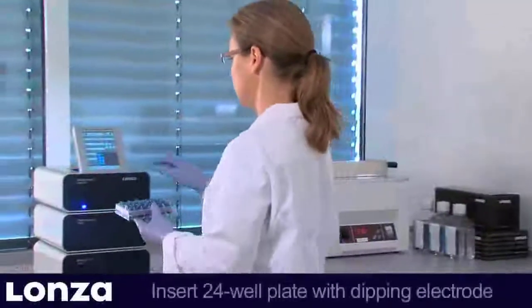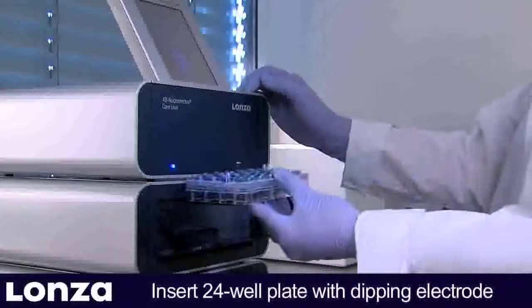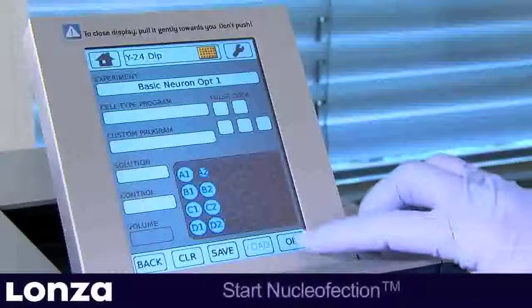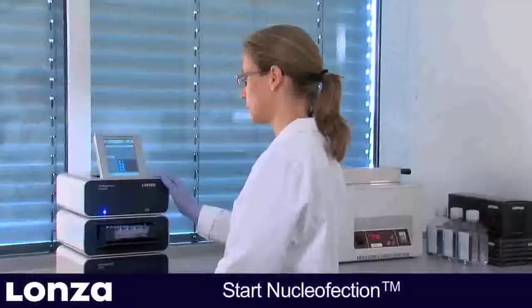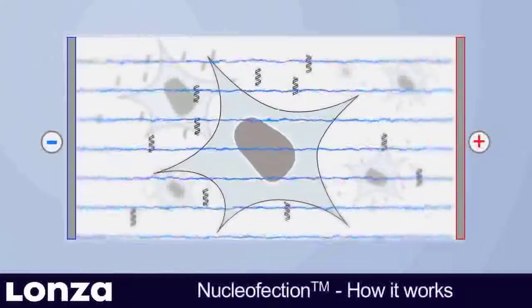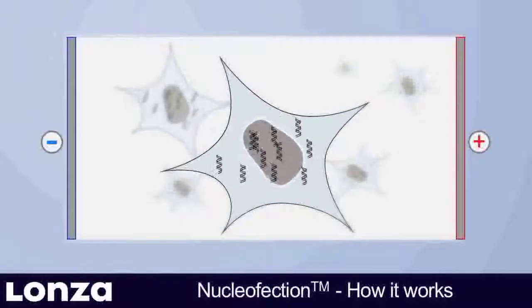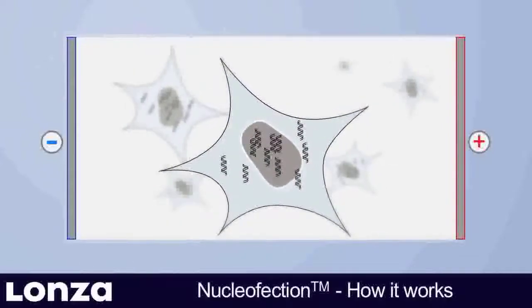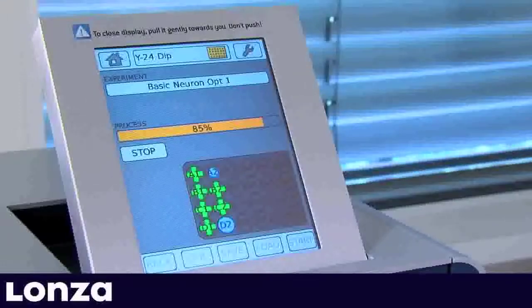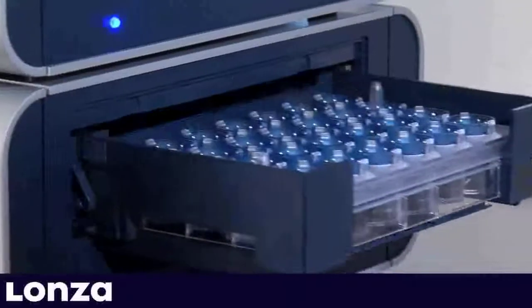Place the 24-well plate with the dipping electrode into the 4D Nucleaffector Y-Unit. The predefined experiment is started by pressing OK on the touch screen. Each well is now processed individually. Nucleaffection transfers the substrate into the cytosol and the nucleus of the cells, thus enabling transfection of resting and non-dividing cells. As soon as all wells have been processed, the retainer opens automatically.